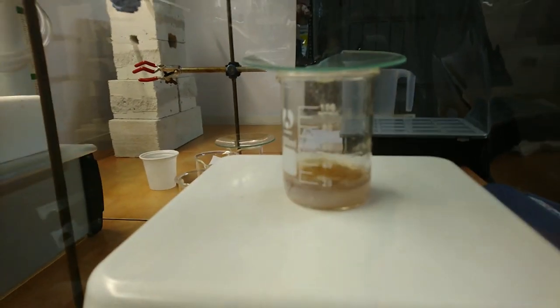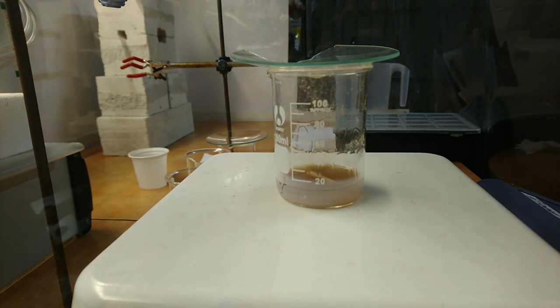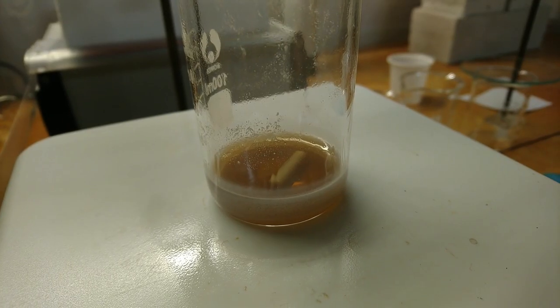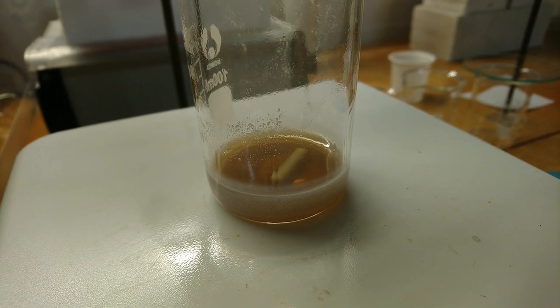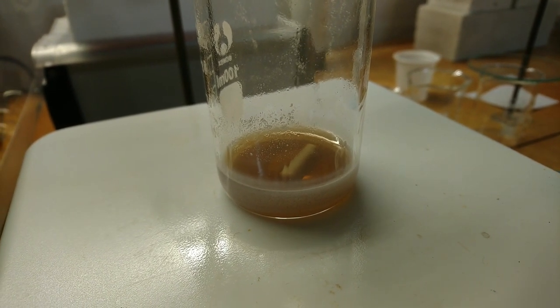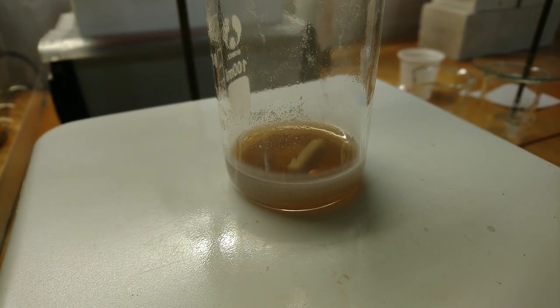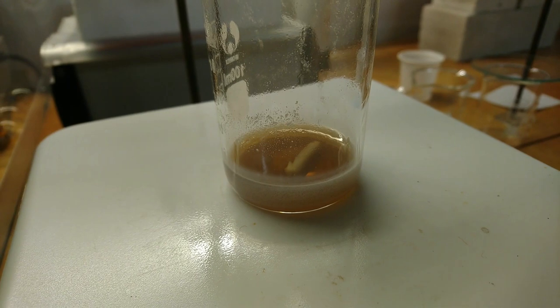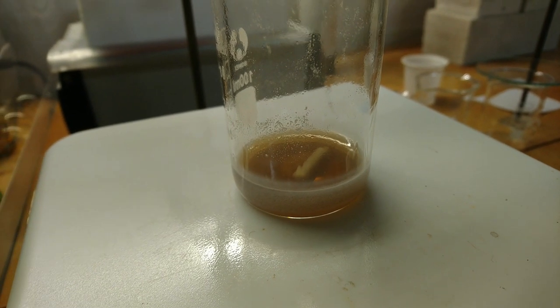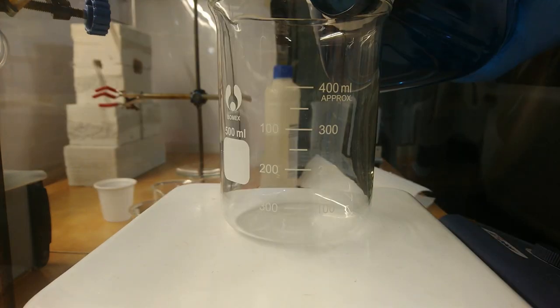Eventually, almost all of the titanium dioxide should dissolve, leaving only tiny white residues stuck to the beaker sides. With the titanium dioxide I bought from eBay, even if listed as 99% pure, the solution color was brown, while other references — such as Brauer — state that it should be colorless. Most likely, my titanium dioxide was not as pure as advertised.